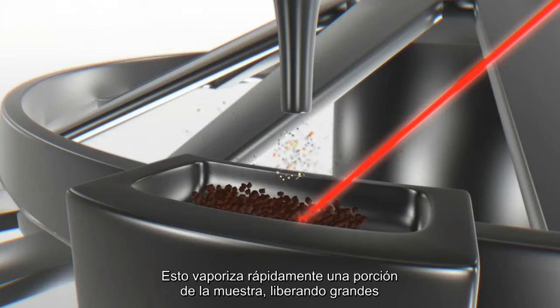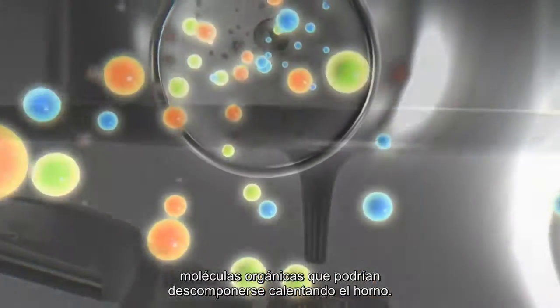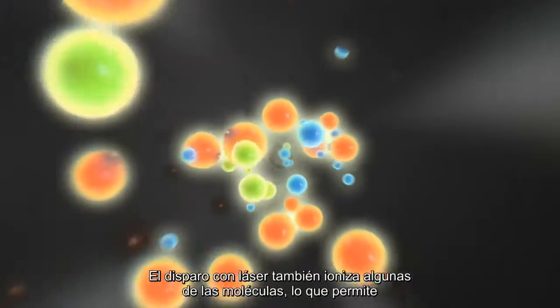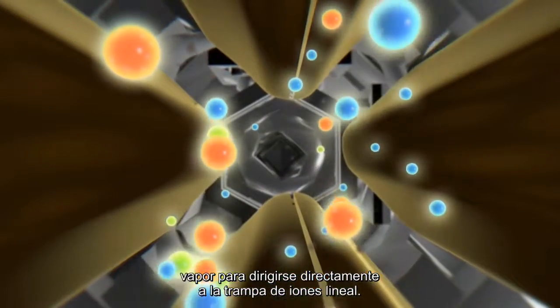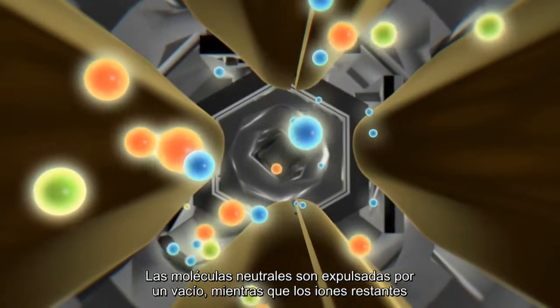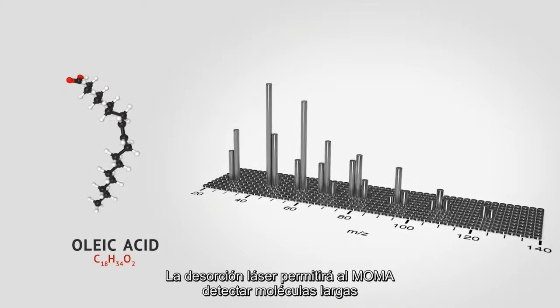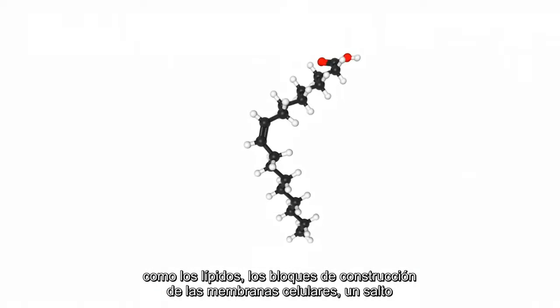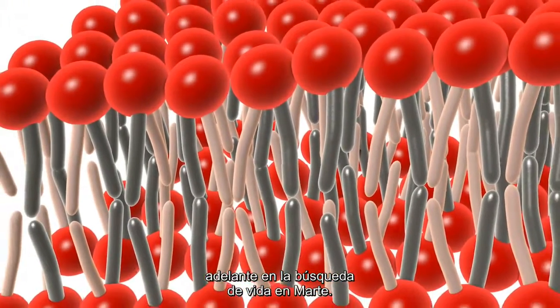This rapidly vaporizes a portion of the sample, releasing large organic molecules that could be broken down by oven heating. The laser shot also ionizes some of the molecules, allowing the vapor to head directly to the linear ion trap. Neutral molecules are ejected by a vacuum, while the remaining ions are sent to the detector to determine their chemical makeup. Laser desorption will enable MOMA to detect long molecules, like lipids, the building blocks of cell membranes, a leap forward in the search for life on Mars.